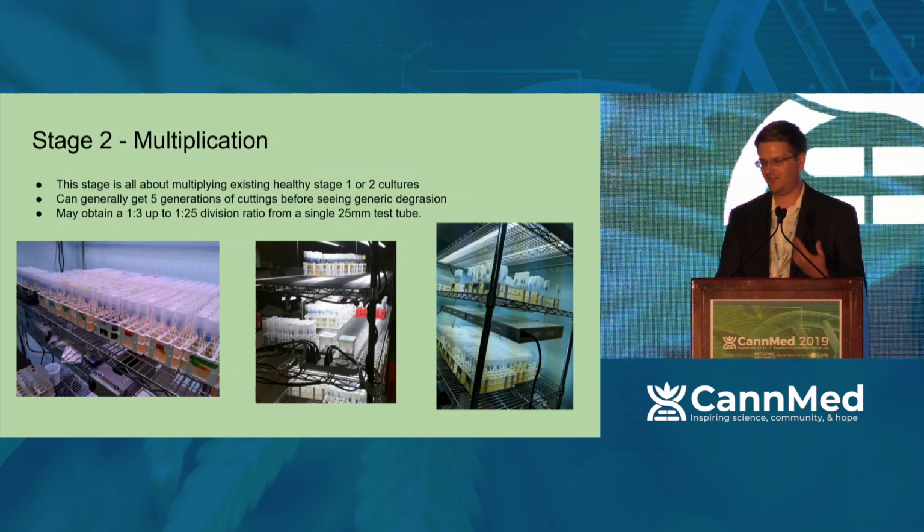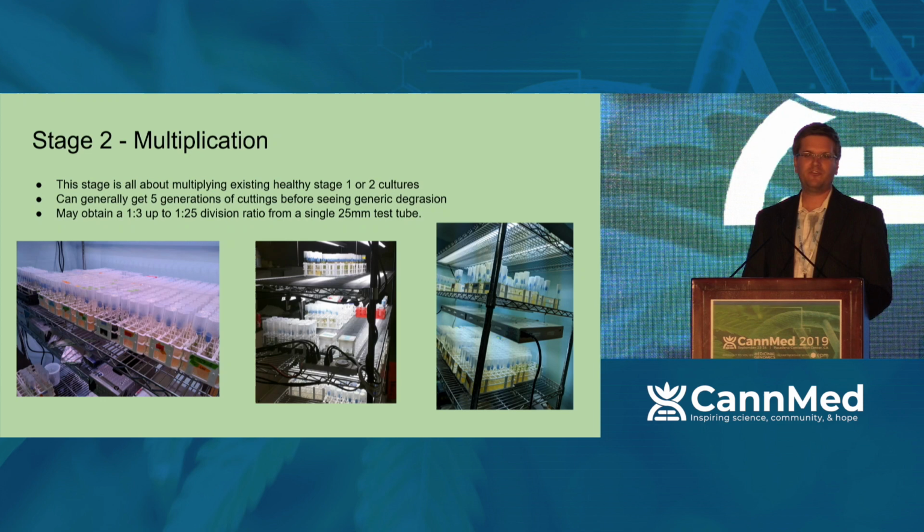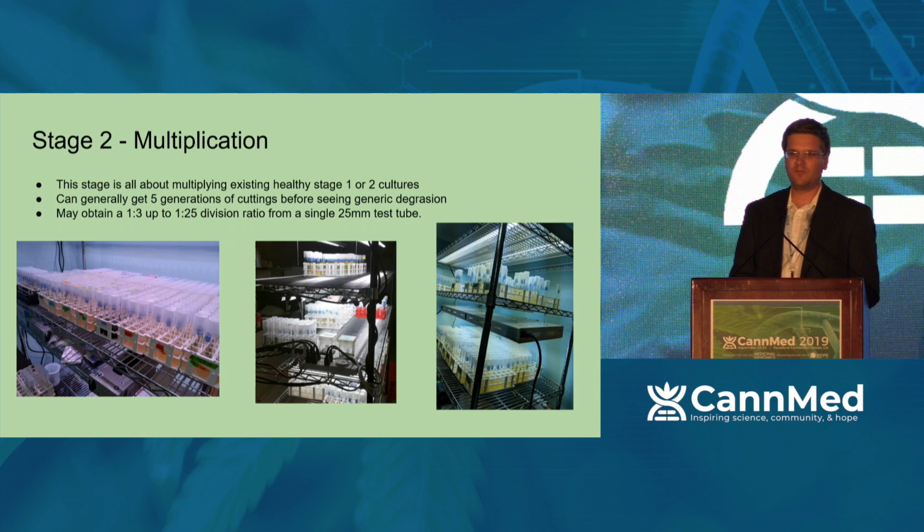I actually have some pictures coming up of some of those things. So stage two is the multiplication stage. I was typically getting a 1:3 to 1:8 division ratio per culture every single time I did this. And that culture media only cost a couple cents a piece, so it's virtually free to do once you set up the lab.